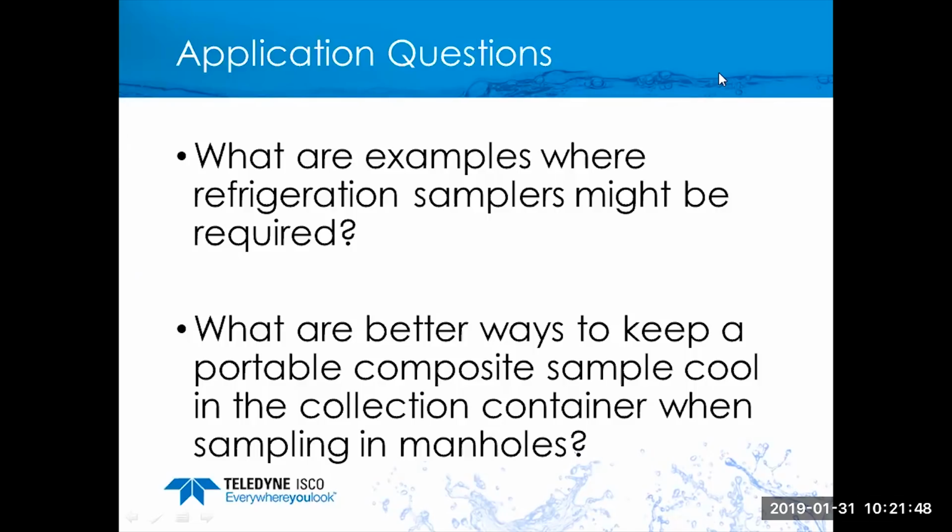At times, this can also be accomplished with the use of a preservative material that would be placed in the bottle in advance, usually in tablet form, and when the sample is collected, it dissolves and is able to preserve the sample quality. And those preservatives are typically recommended, again, by the analytical lab performing the analysis. However, again, the focus on this particular presentation is portable samplers, meaning there's an absence of AC power.